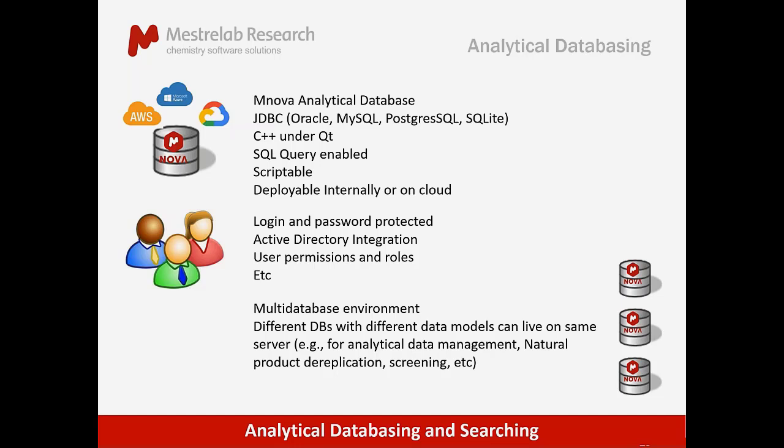And then, from the perspective of databases, the interesting thing is that you can set up any number of databases that you want. This is in fact not the case for MyData, the environment that you have right now. I think there we have a limit of 8 or 9, I cannot remember. So you could have a database for your compounds, a database for impurities, which you search when you find an impurity in your data, a database for byproducts, and maybe some other databases, for example third-party data, CRO data, etc., or even by project or by category of product, right?